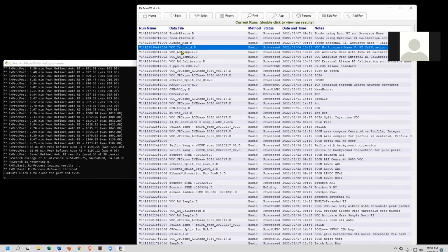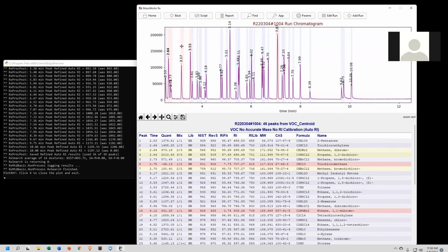One of the things that we can do with quantitation, semi-quant, not full quantitation, but you can define a target peak, and you can define a reference peak, and you basically do semi-quant with it, and you can take into account a scaling factor. But the interesting thing is we let you define these peaks by retention time or retention index. So that means that it can work a lot better. And even in a mixture peak, we can tell it to not only look for the retention time, but look for the component ID. So it's a very powerful mechanism.